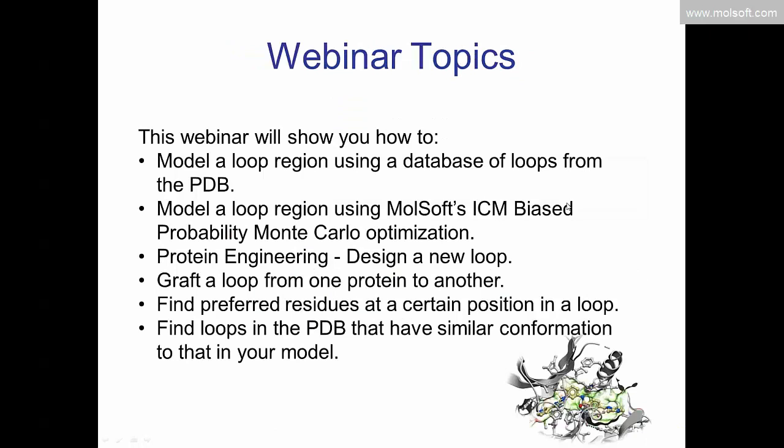So today's webinar topics include how to model a loop region using a knowledge-based approach, so using a database of loops that's derived from the PDB, and then also how to model a loop region in an ab initio way using an ICM bias probability Monte Carlo optimization method.